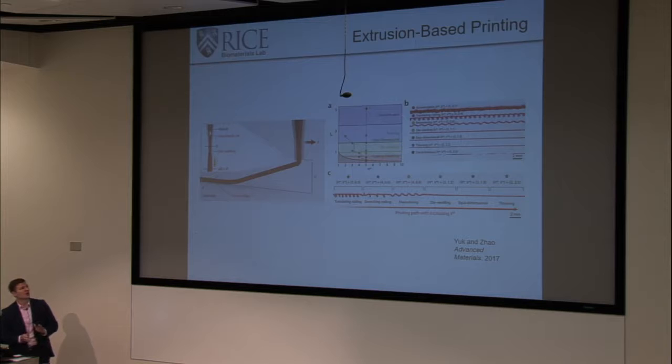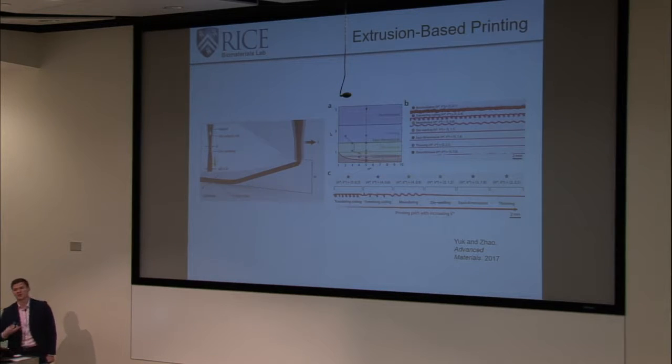So again, when you're designing a biomaterial or you're designing your bioink, it's not just the materials and the cells that you have to consider, but it's all these little factors that you have to make sure you have time for, you accommodate when you're printing, because you will never produce a scaffold with good resolution or the size and geometry you're looking for unless you really narrow down these parameters.